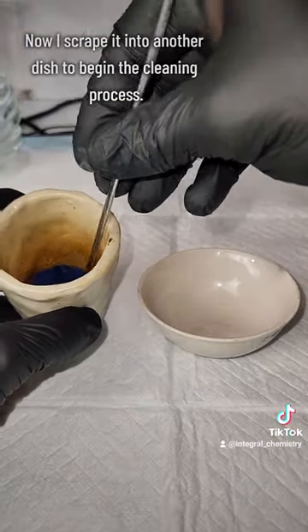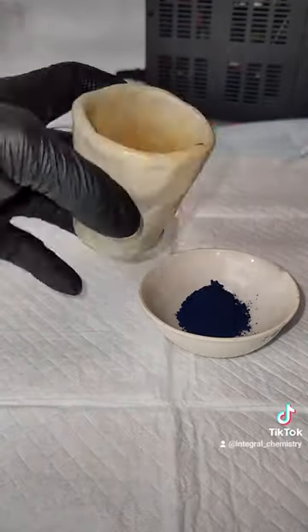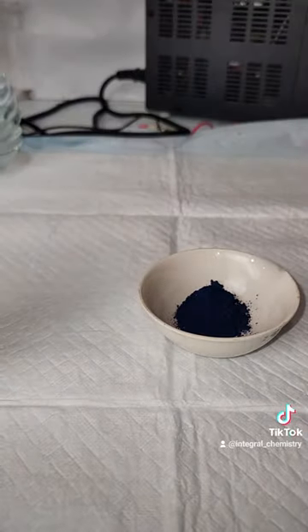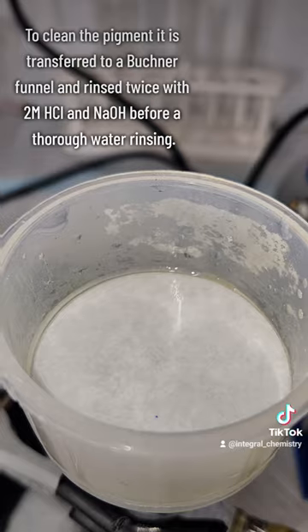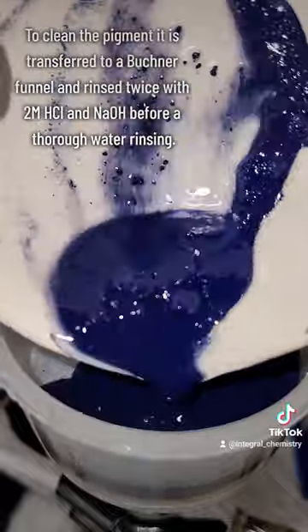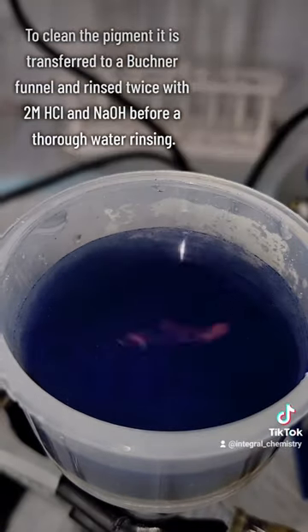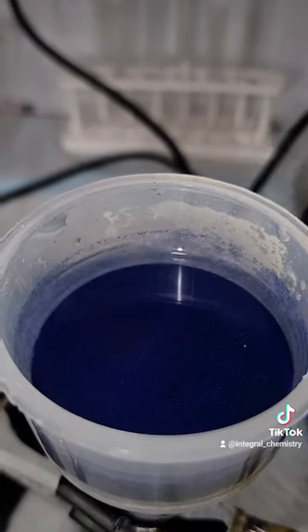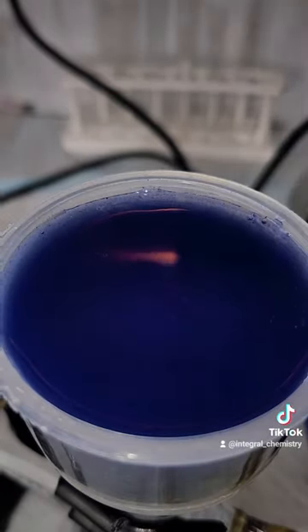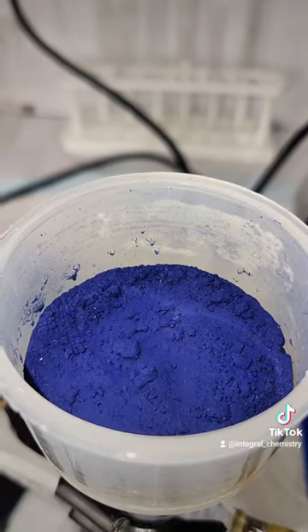My next step is to gently scrape it into another dish to begin the thorough cleaning process. This cleaning process is done to remove any unreacted byproducts from my pigment. I load my pigment into a Buchner funnel and rinse it first with a 2 molar hydrochloric acid solution, then rinse with water, then rinse again with a 2 molar sodium hydroxide solution, followed by another thorough water rinsing. This process is repeated twice, and then the resulting pigment is transferred to a drying dish and allowed to dry at 80 degrees Celsius for about 5 hours.